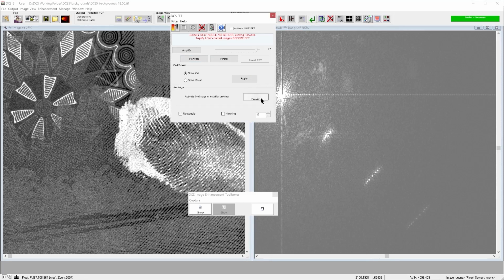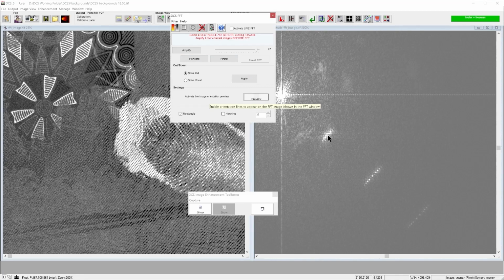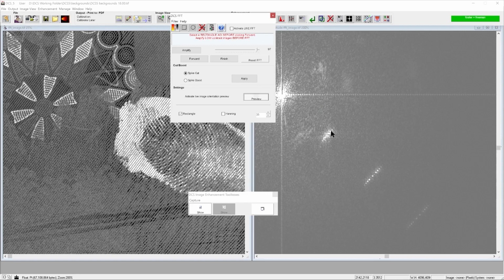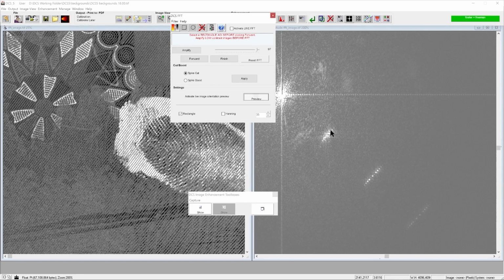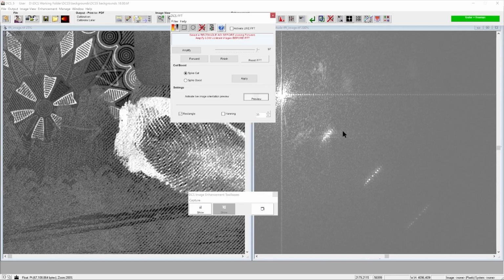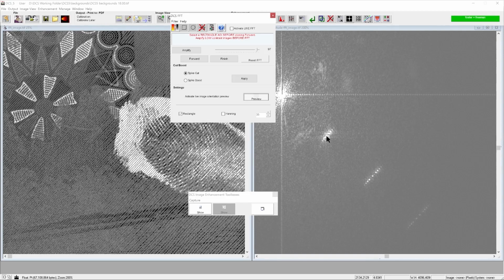And if we select image preview and move the mouse onto the white dots, we can see that we now have lines directly on top of the lines in our original image. If I move it here, for example, the diagonals are now in the opposite direction, so they're no longer what we're looking for in the image. If we move back, these dots here relate to this diagonal pattern in our fingerprint image.